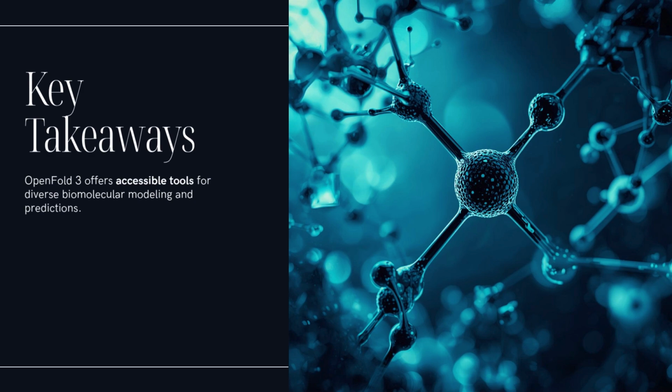And running locally lets you point to, say, pre-computed MSAs if you have them. Exactly. Essential if you're doing thousands of predictions and need predictable performance, or if you want to use your own custom alignment pipelines. You get full control.